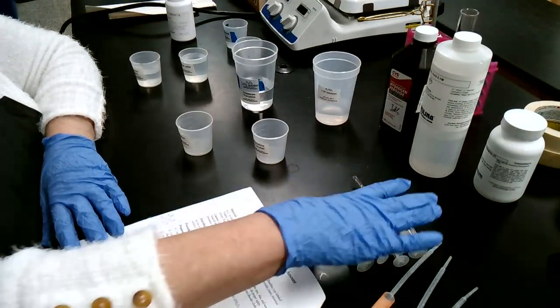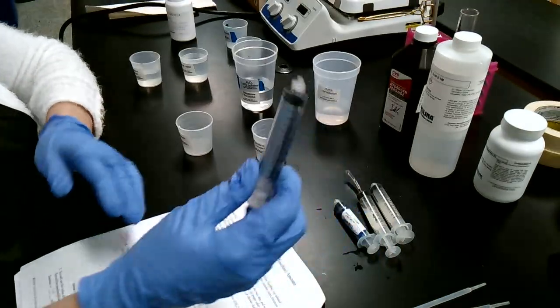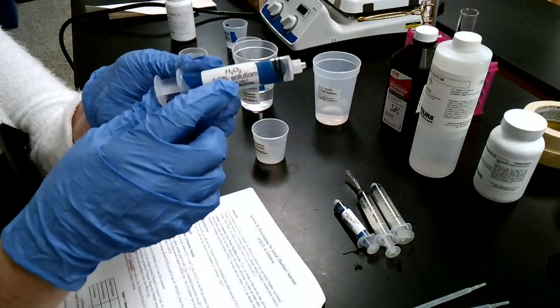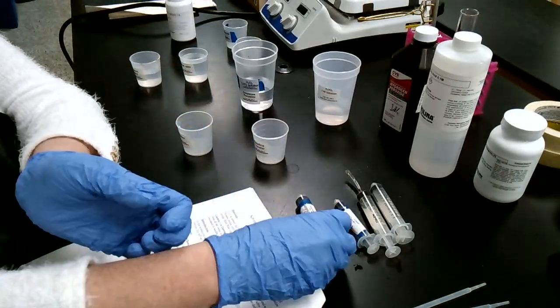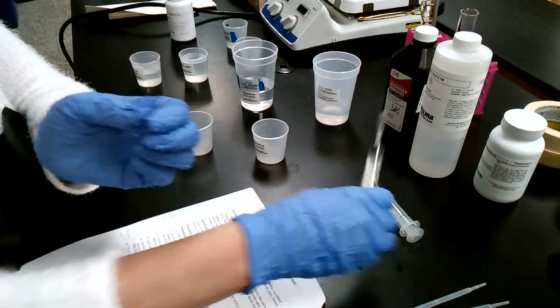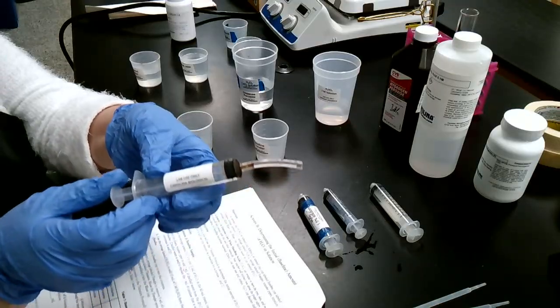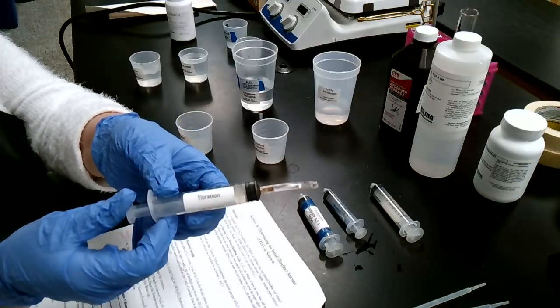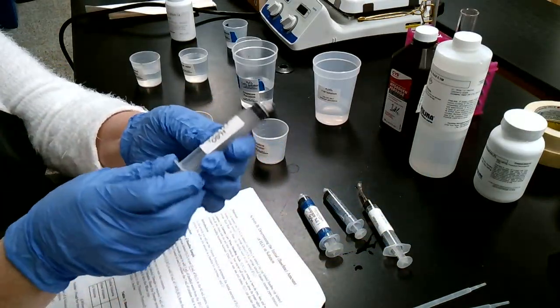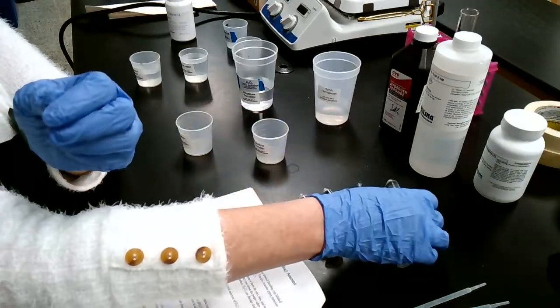But a few things I want to show you. First off, the difference between syringes and pipettes. Syringes are these little plunger things, and you'll see we have one that says H2O2, which is our hydrogen peroxide one. We have one that's a transfer syringe. We have one that's the titration syringe, which will bring up the potassium permanganate, and you'll use that to titrate. And then we have one that has H2SO4, which is a sulfuric acid one.